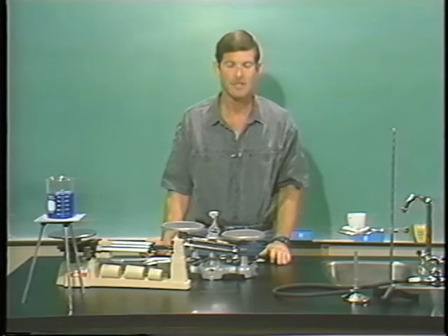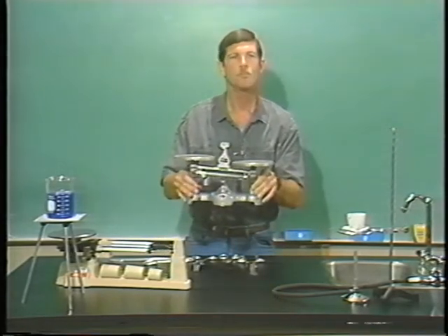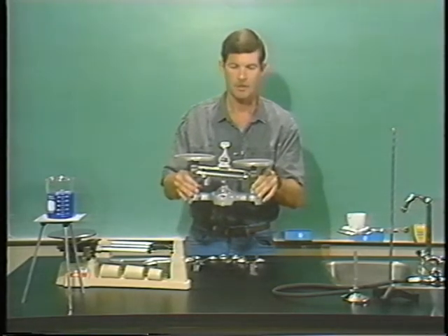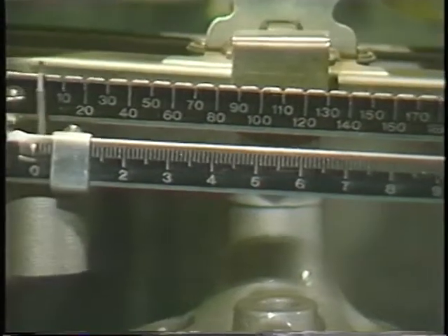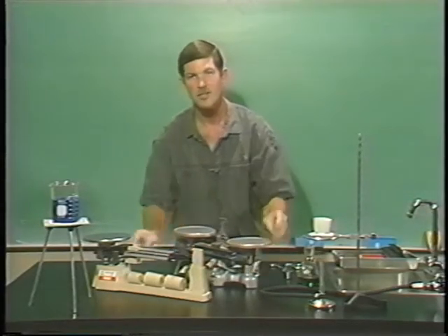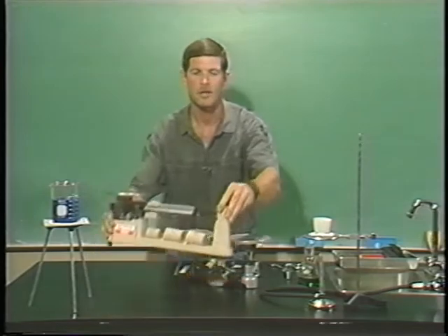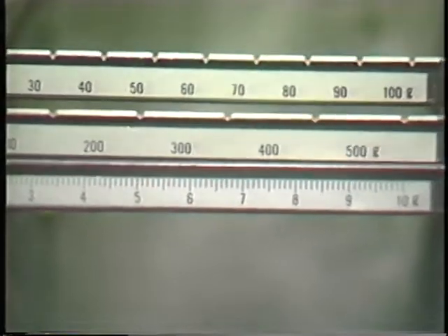Got that? I've got two types of balances here. This first one is a double platform, double beam balance. It has two platforms and two beams. The beams are the little arms that the counterweights slide on. This next balance I have is a single platform, triple beam balance. And you'll see that it only has one platform and three beams.